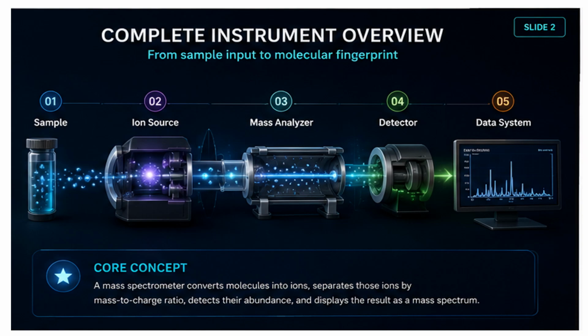The mass spectrometer works in 5 main steps. First is the sample. The sample contains the molecules that we want to analyze. Second is the ion source. Here, the molecules are converted into charged ions, because only charged particles can be controlled and measured inside the instrument.